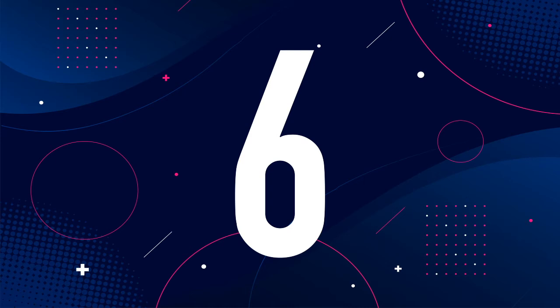This is because we're able to see more of a broader view. As soon as I go to that 40 or the 100, I'm dialed in. I'm getting in close, and it's much harder to scan now. It's like, I went from this broad view to, whoop, I'm like right here, okay? And that's nice, but remember, just like what we saw with our letter E, we can get so close we lose details. Right, so you can get too close. It's like doing a close-up and now somebody's like right here. It's like, that's a little too close.